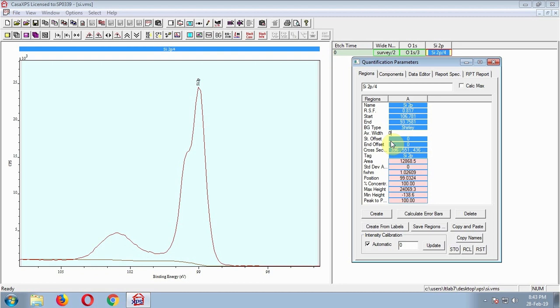I guess Shirley works better. Keep this in mind — Shirley will fit better in most of the cases because RSF values stand good with Shirley. So in your second step, you should make sure RSF values are correct. Another factor which makes Shirley more usable than others is that Shirley takes care of the asymmetry of the line shape near the background.